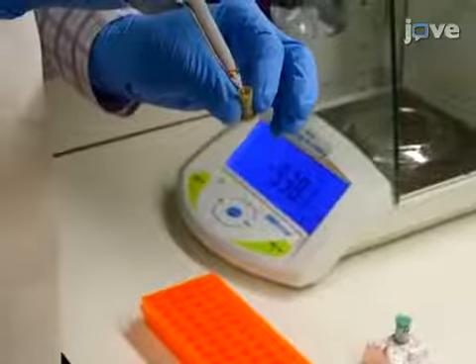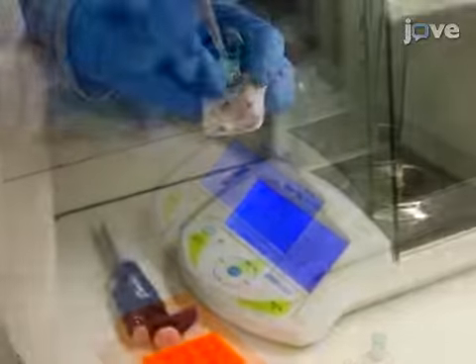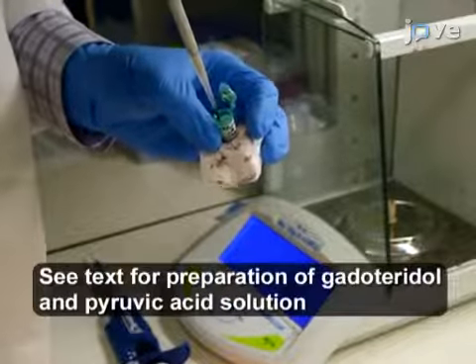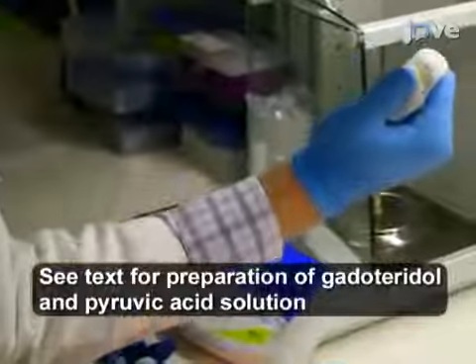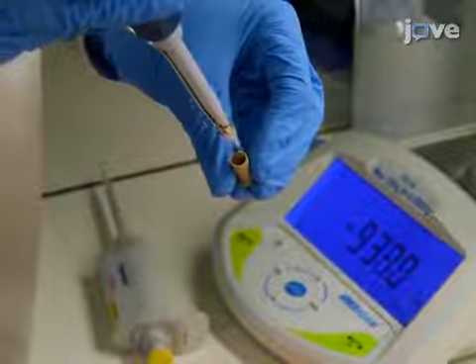In a sample cup for a dynamic nuclear polarization, or DNP system, pipette 0.3 microliters of the gadoteridol solution and 13 milligrams of the pyruvic acid solution. Briefly stir this mixture in the sample cup with a pipette tip.